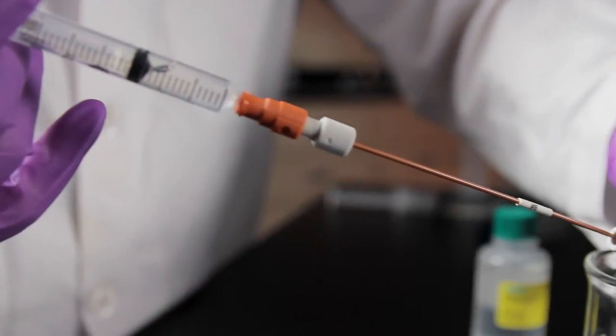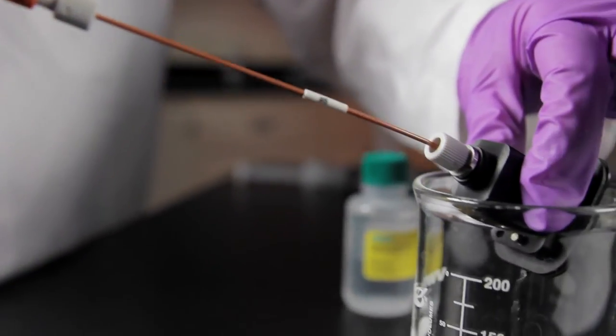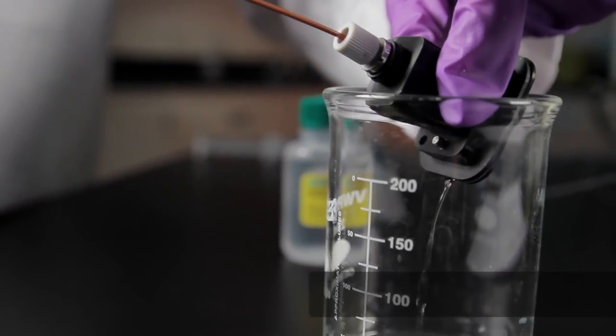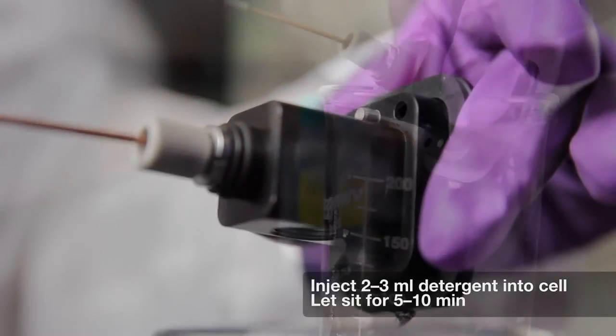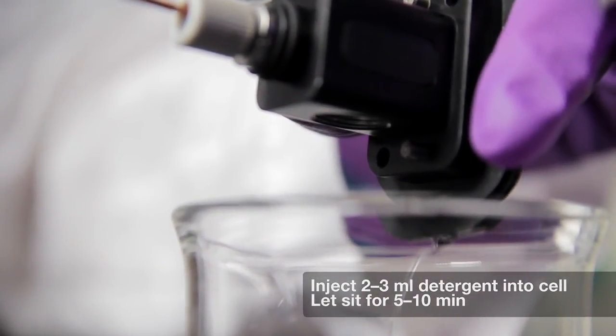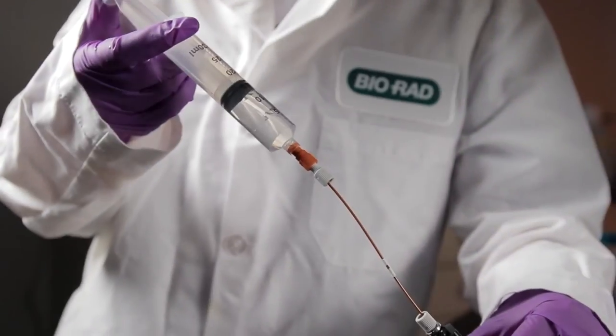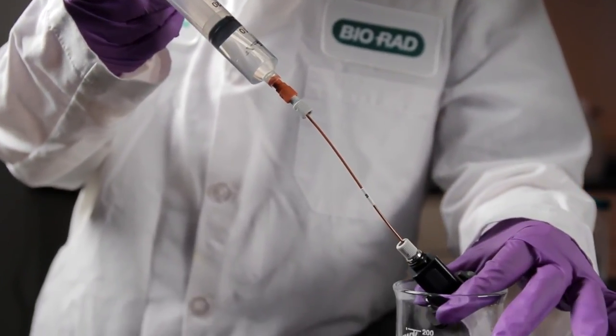Using a syringe attached to tubing, inject 2-3 mLs of the detergent into the flow cell and let it sit for 5-10 minutes. Then flush rapidly with 10-20 mLs of water.